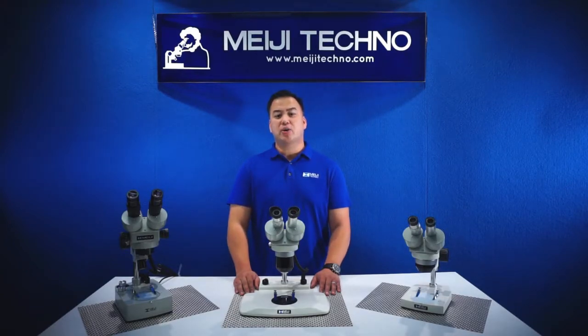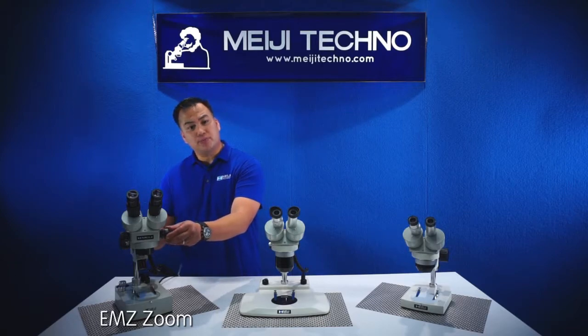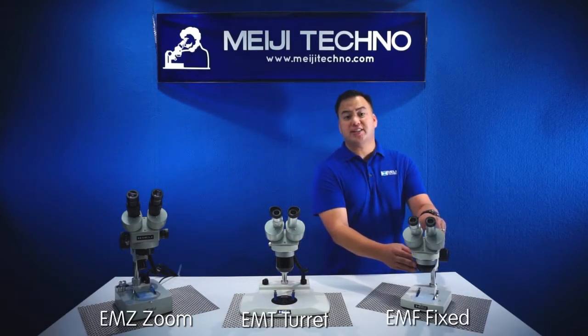The EM Series is categorized into three different bodies. We have the EMZ Zoom, the EMT Turret, and our EMF Fixed Body.